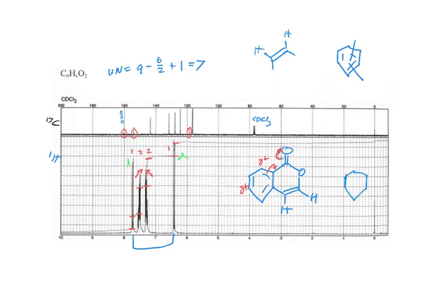So what happens if we reverse this? Oops, that's not what I wanted. Okay, we put the carbonyl next to the benzene ring because we said it was kind of upfield, but if we draw it like this, it's still conjugated, so it would still kind of be in the upfield range.